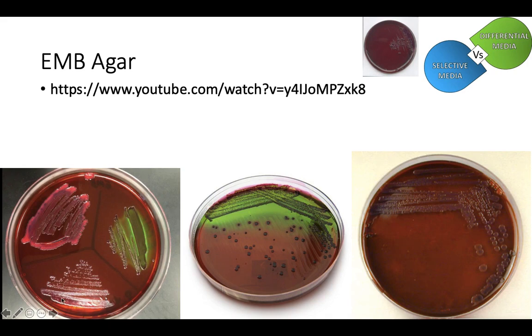So poor little guys like Salmonella that cannot eat lactose, they produce a basic byproduct through fermentation of proteins. These guys don't uptake any dyes at all. Their cell walls become hard because of that basic byproduct, that basic waste, and that basic waste prevents any dyes from being taken up by their cells. So they remain clear. You cannot see any color change at all in this bacteria. It's just growing on top of the plate. So this is EMB agar. Very interesting little agar that's used specifically for gram negatives and almost exclusively to identify E. coli.